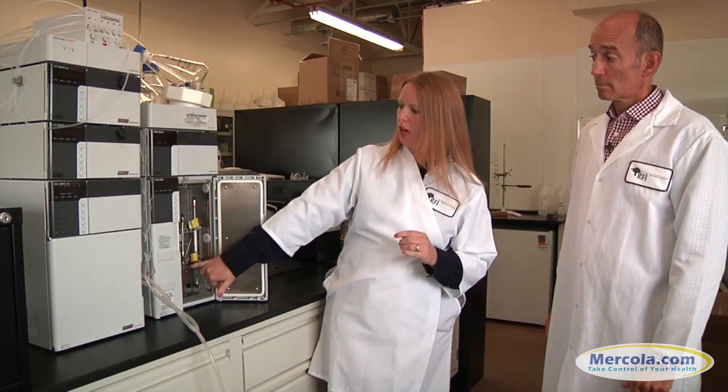Okay, so what we use is a reverse phase HPLC, which means these columns here are packed with a non-polar substrate, usually silica with some kind of compound added to them. We use a polar mobile phase that then pulls our product through the column, and things with a higher polarity come off first, and the things that are more non-polar come off last. And these different peaks give us another fingerprint, just like the FTIR did, where we can quantify not only what's underneath the peaks, but the number of peaks will tell us what the product is.